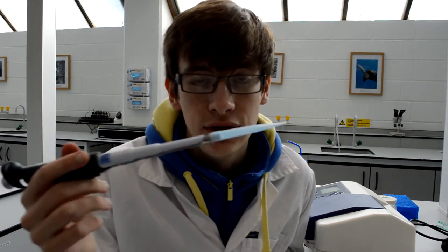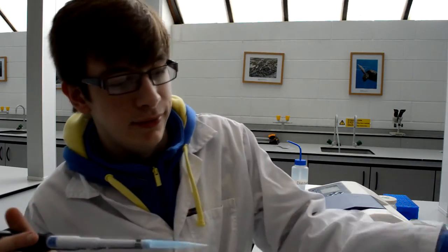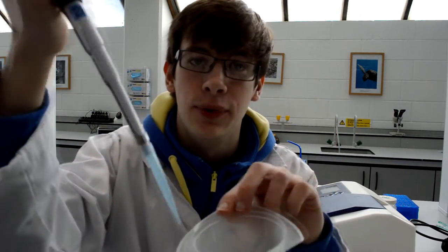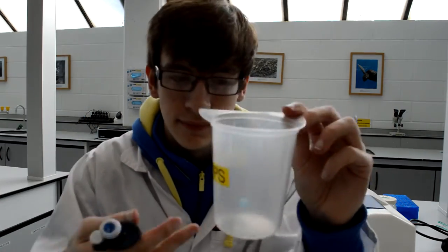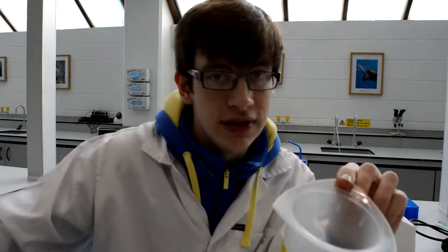So when you're done using your tip, you just take it into the little used tip pot that you have and push down on the white release trigger that you have here, and then you've got rid of the tip, and you can use a new tip for your new measurement. For the love of God, always use a tip. You have to use a tip, otherwise you will end up screwing up a pipette.